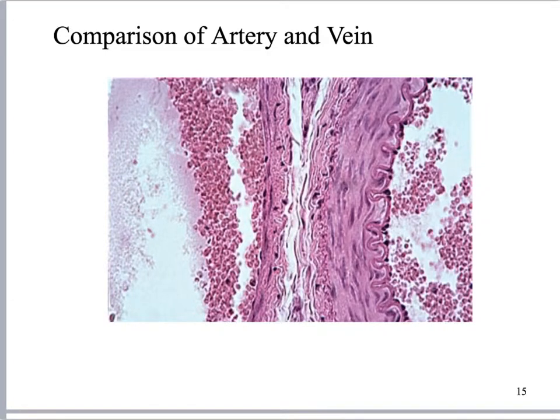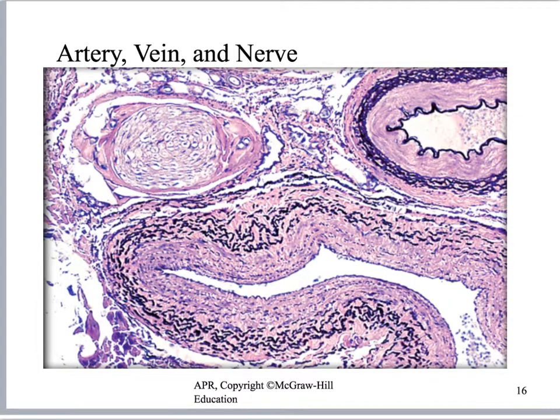I'm going to count to five — while I do, tell yourself which side is artery and which side is vein. This is the artery, this is the vein. How do you know? A little bit from the lumen, the ribbon shape of the tunica interna, and that thick tunica media — those are your key indicators. Now I want you to find the artery again. Here's your artery, here is your nerve, and here is your vein.